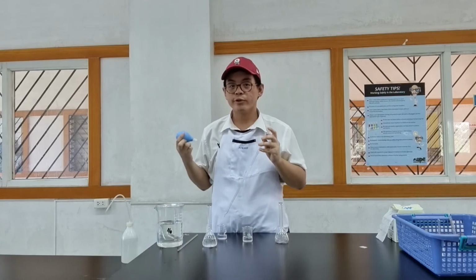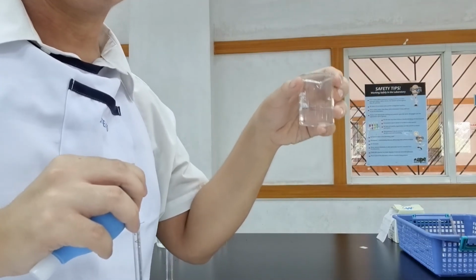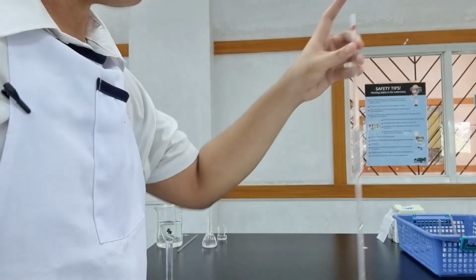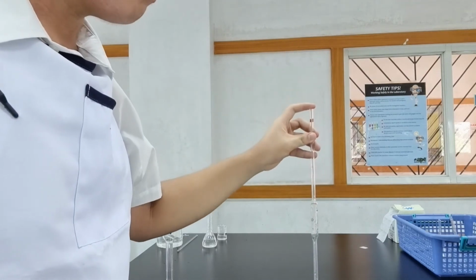I will now show you how to get 10 ml, so I'm going to transfer up close. I have here the solution, and again, I'm going to take out 10 ml using a pipette. So to do that, I'm going to take my pipette. I'm going to make sure that it's completely vertical, and then I'm going to submerge it.